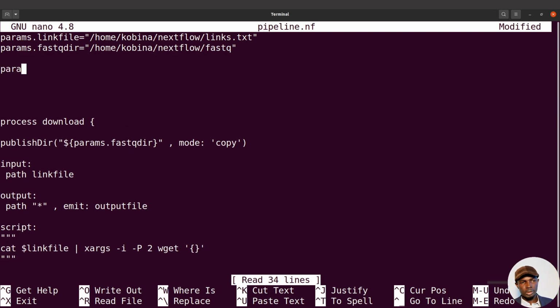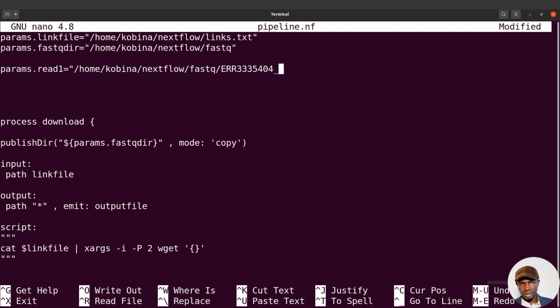So I'll say params.read1 equals, and then I'll say /home/, and the file path, /_1.fastq.gz.